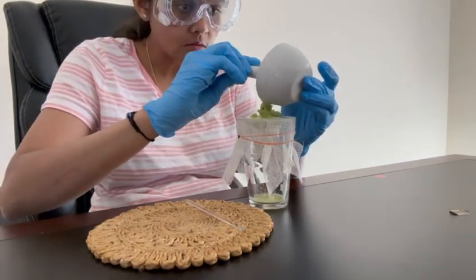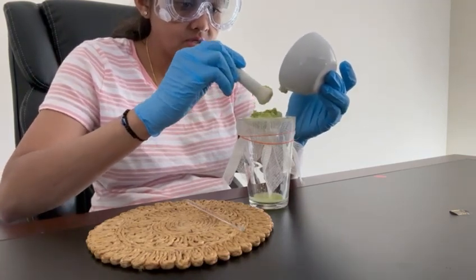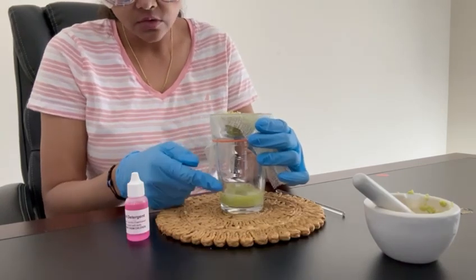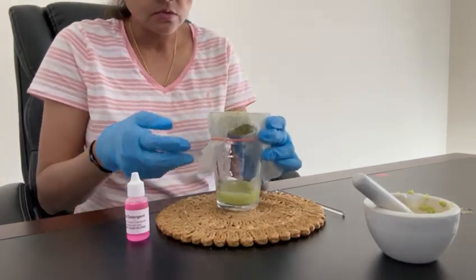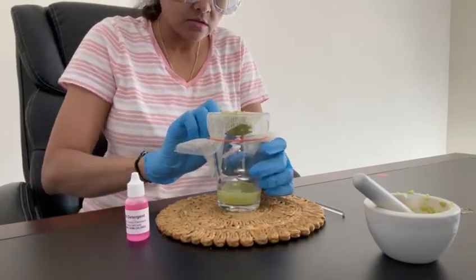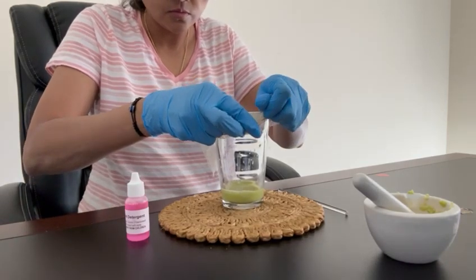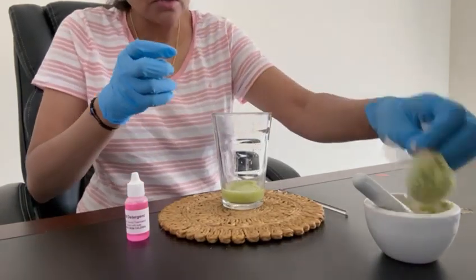I'm going to let it transfer all the materials through this. So now I let it strain my peas into the glass, and now we have in the glass, as I can see, the strained fluid. What I'm going to do next is gently take off this, because we don't need the content that we have in the cheesecloth. Gently taking that off, and it goes in the trash can.